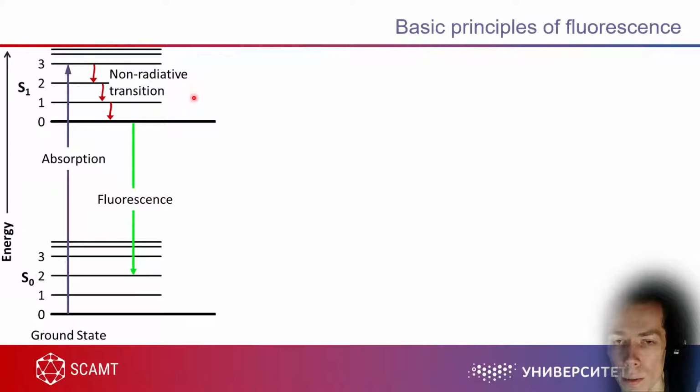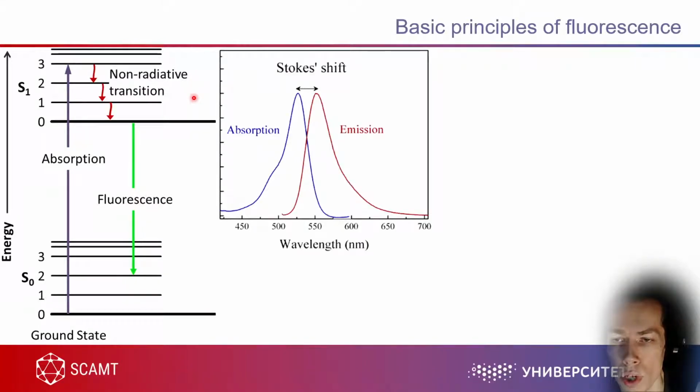When we are talking about common fluorescent dyes, usually it's just a Stokes shift. So Stokes shift, it's a process.